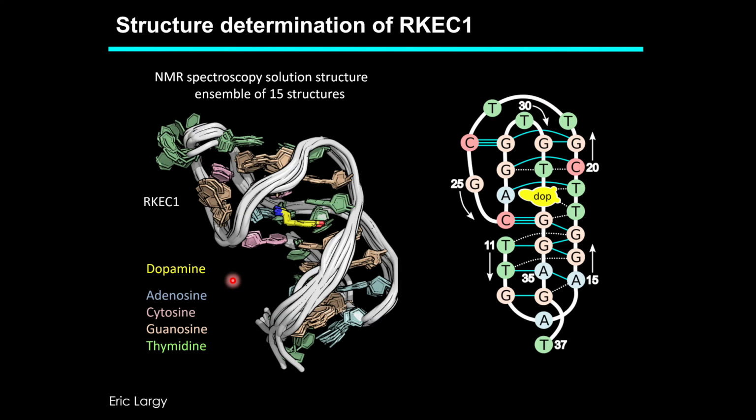Instead of having the duplex, in fact, the 5' end, which is here, and the 3' end, which is down here, are actually not together. So they don't come from a single duplex, as you might have guessed from the original M-fold prediction. Instead, you have regions that are somewhat 3 bases together. There's regions where there's maybe 4, and there's just a lot going on.